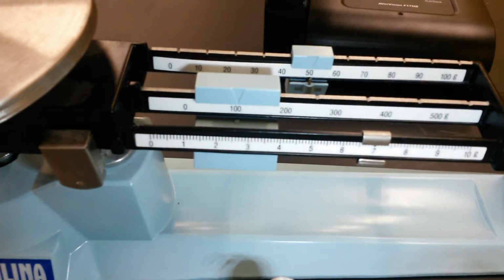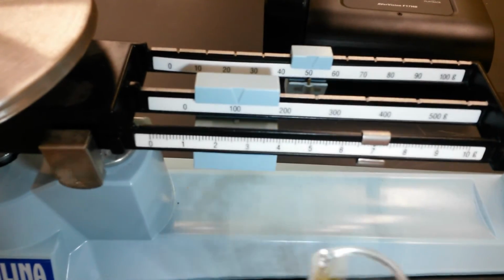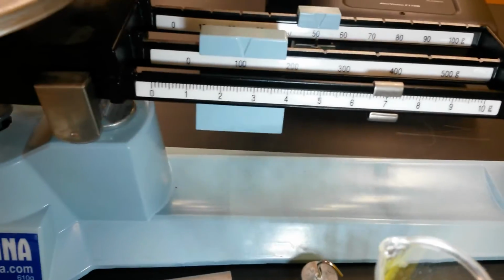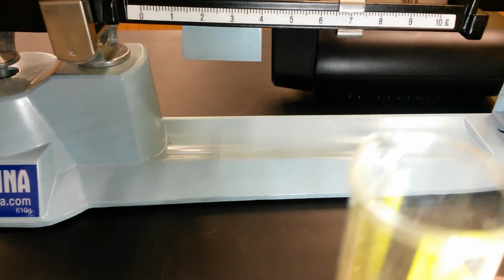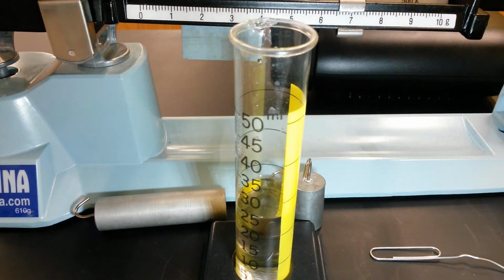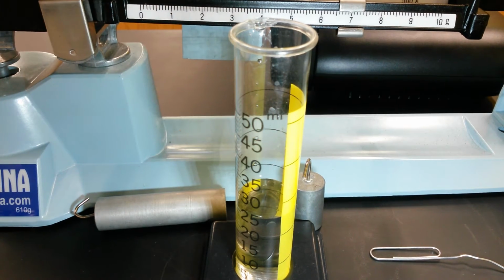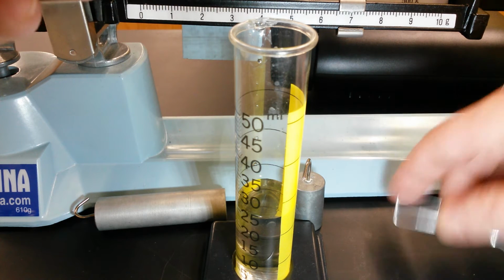Now, as you can see here, I have filled it up to approximately 25 milliliters. Get this lined up. Okay, so around 25 milliliters. Now, to measure the volume of an object, of course, you figure out what the volume is of the water currently. Okay, then you drop in an object.